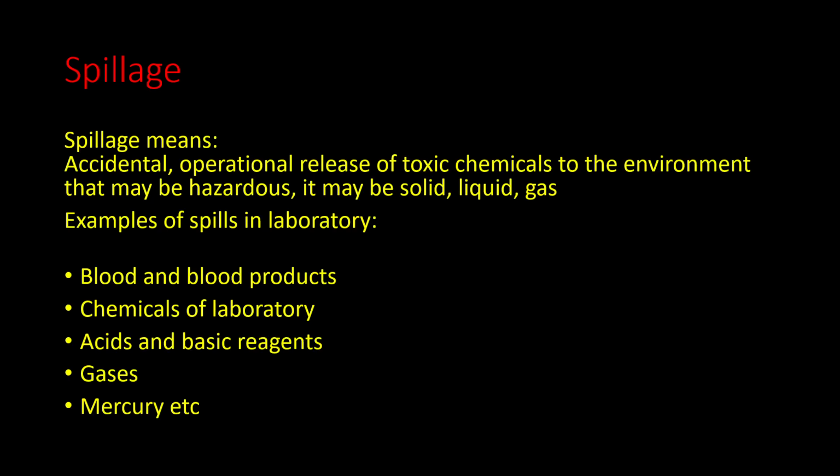Welcome technicians. Today we look into how to handle spills. Spills are very common in any laboratory, hospitals and all. So we have to look at how to manage it. Okay, what does a spill mean?